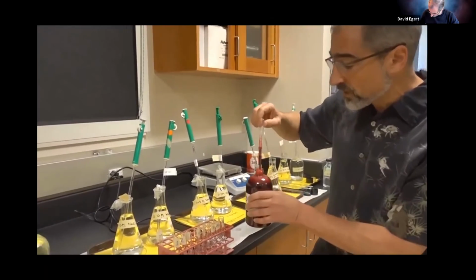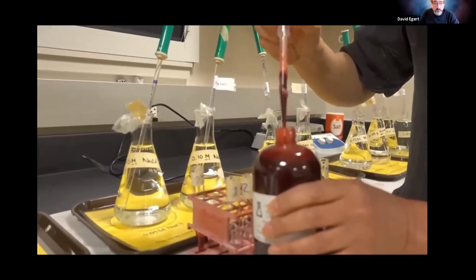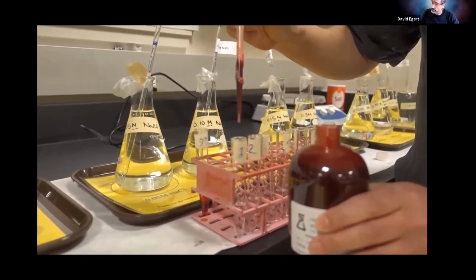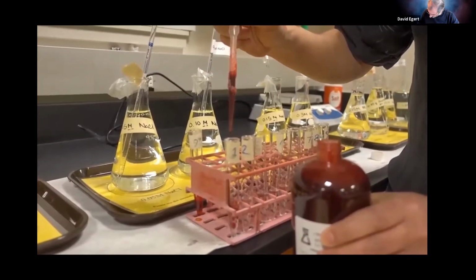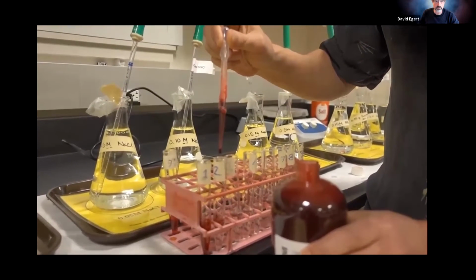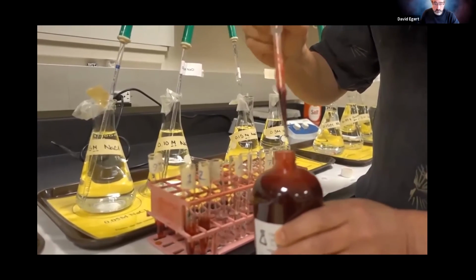So these drops, we try to make them as consistent as possible. It's going to be 6 drops. And it's not just around 6. I really want to do 6 well-formed drops. 1, 2, 3, 4, 5, 6. 1, 2, 3, 4, 5, 6.